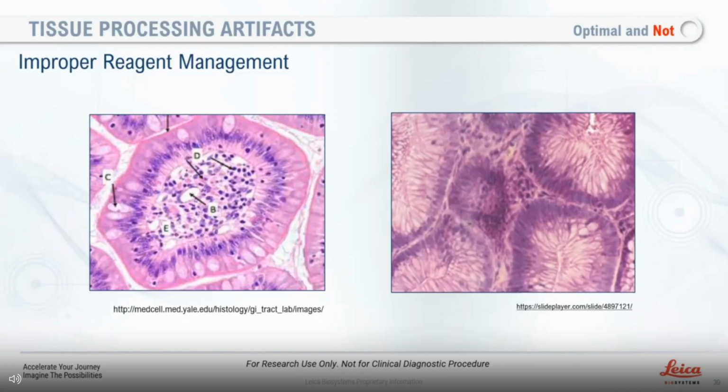I think I can speak to what the standard fixative is for breast tissue. Neutral buffered formalin, as most of you know, has been around for a long time and is the standard fixation. I think optimizing that breast tissue for studies that follow is what's really key. If you're in a clinical setting, it's different than if you're in a life science arena. But if you read any textbooks or literature, 24 to 48 hours is ideal, and that certainly has different requirements when it's research versus a clinical setting.